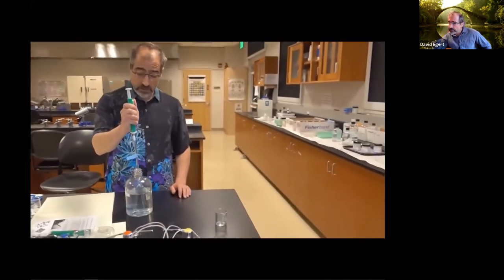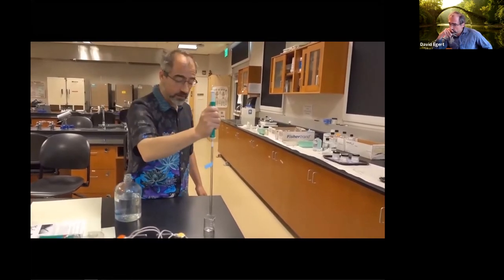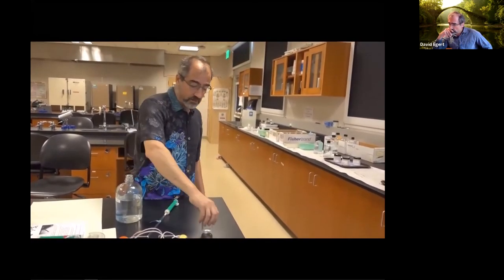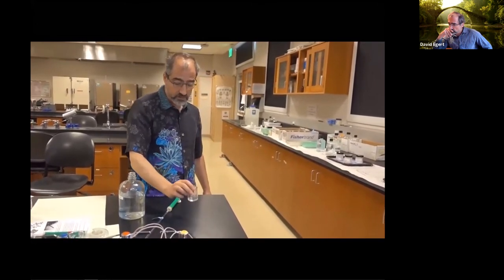Then you're going to pull up 5 mils of distilled water. I'm going to add the 5 mils of distilled water. Agitate, give it a chance to dissolve if it's going to dissolve.